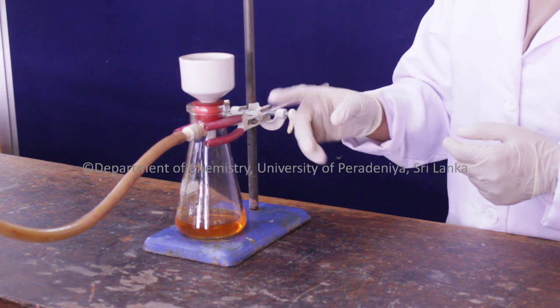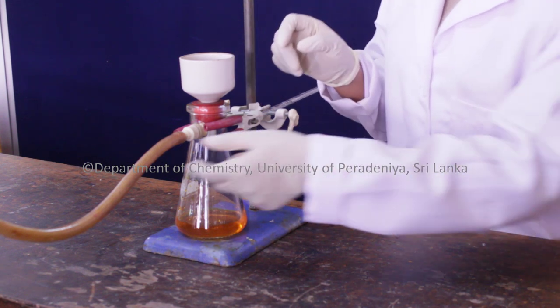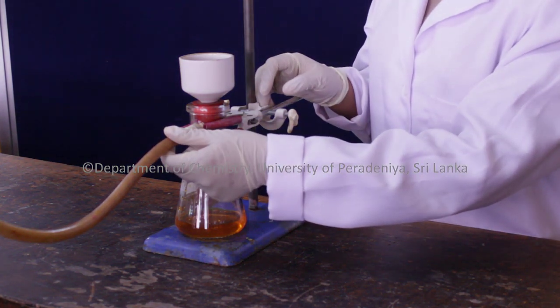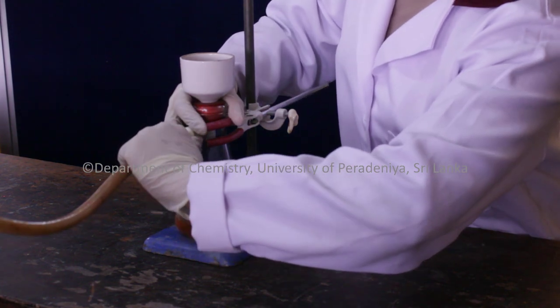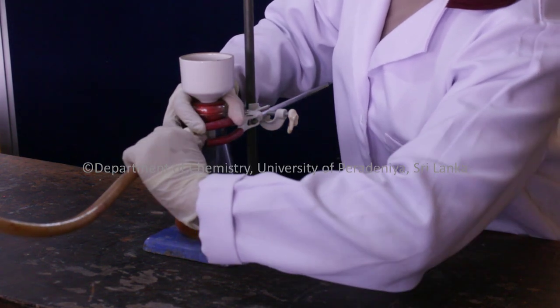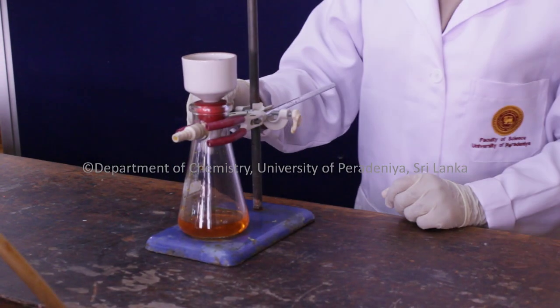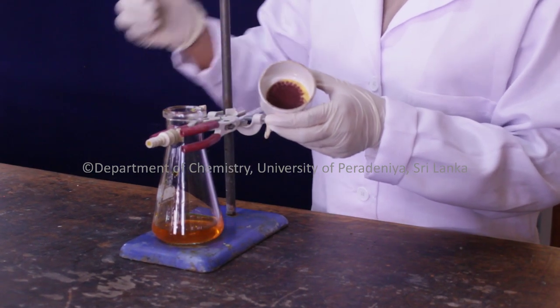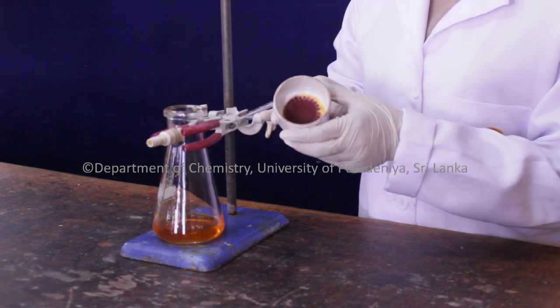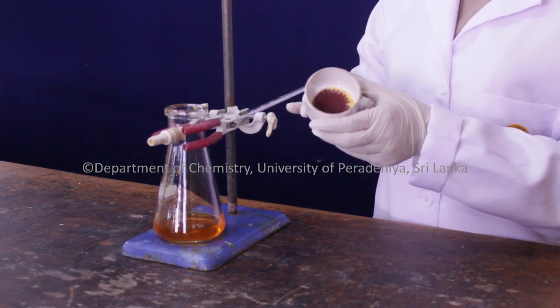After all the solvent drains through the funnel and the solid is dry, you can disconnect the vacuum connection from the Buchner flask. At the end, you will obtain a dried solid more quickly by using this Buchner filtration compared with gravity filtration.